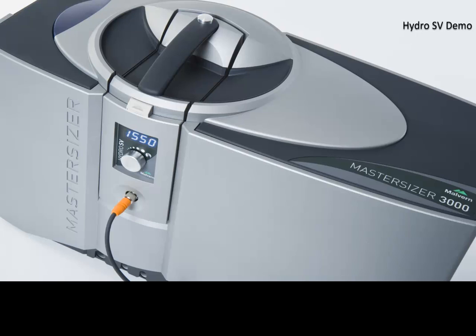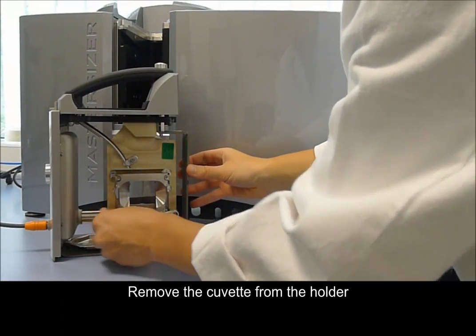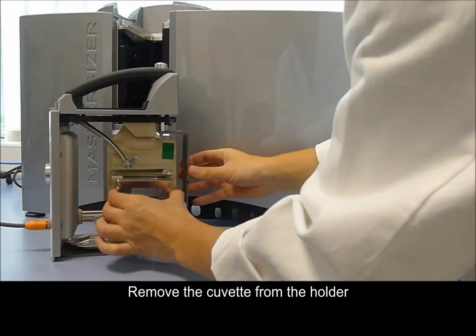In this video we are going to look at a demonstration of the new Hydro SV dispersion unit with the Mastersizer 3000. The dispersion unit is made up of a cuvette which is held within the measurement cell.